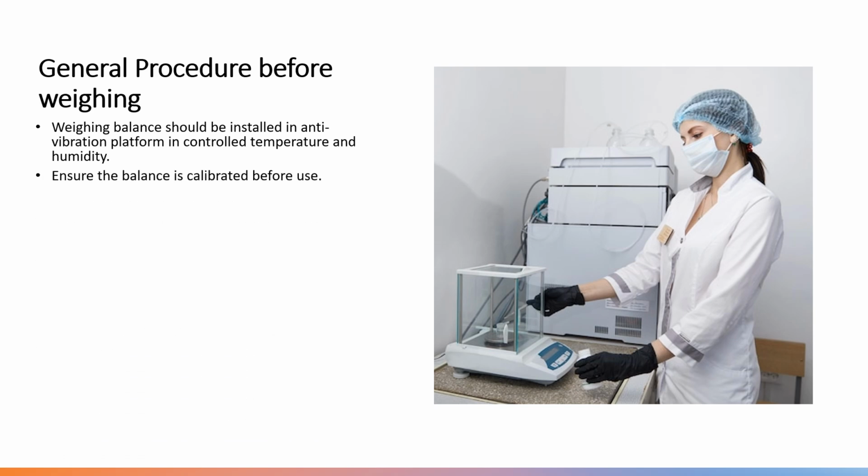Next is ensure the balance is calibrated before use. So prior to taking any weight, ensure that your balance is calibrated, either maybe daily calibration or monthly calibration or any scheduled routine calibration. Next, wear the appropriate personal protective equipment like gloves, goggles, lab coat, etc.